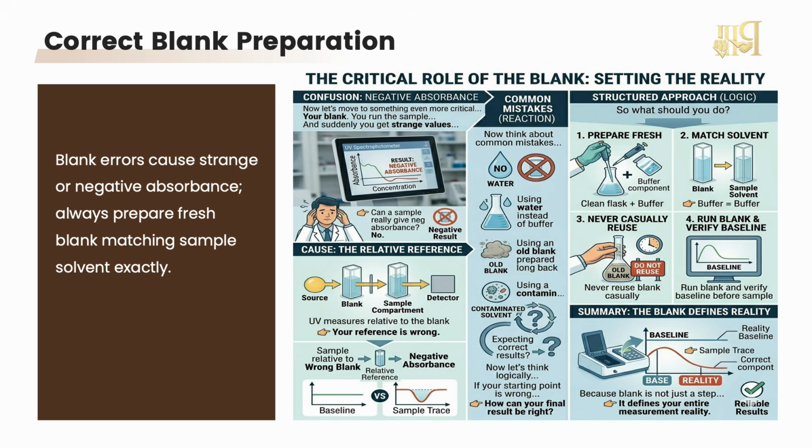So what should you do? Always prepare a fresh blank. Ensure it matches your sample solvent exactly. Never reuse blank casually. Run blank and verify baseline before sample, because blank is not just a step, it defines your entire measurement reality.